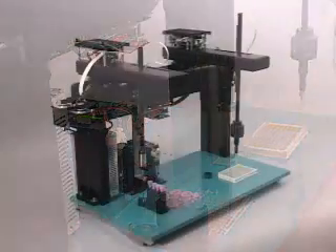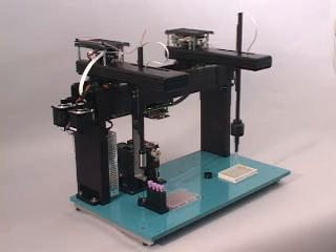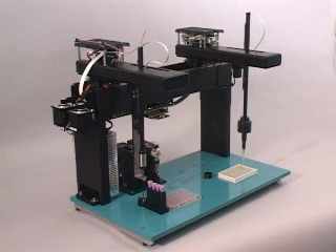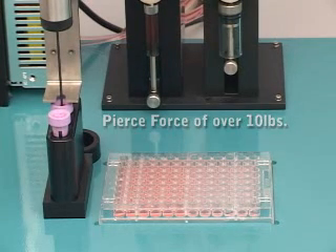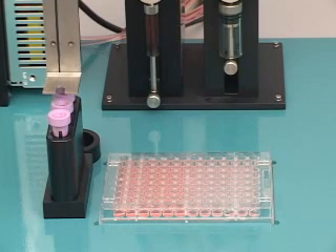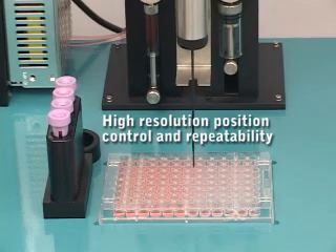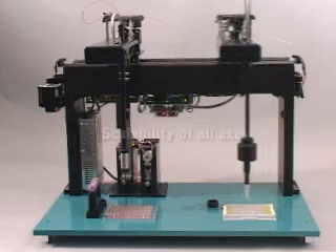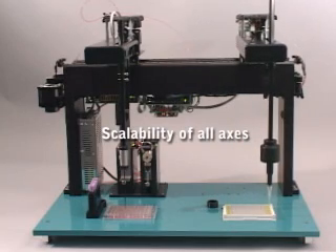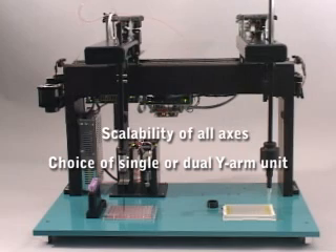Standard features include a rigid Y arm which eliminates the need for space-consuming gantry, a pierce force capability of over 10 pounds, high resolution for improved position control and repeatability, scalability of all axes, and choice of single or dual Y arm unit.